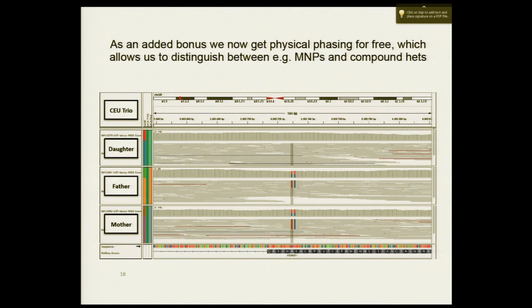What I've read online about HaplotypeCaller is that some people have issues with the genome that they use. Like if they use their own particular genome, it doesn't work, but if they use the one suggested by GATK, then it does work. Are you aware of that at all? No, I'm not quite sure what you mean. You mean like a different reference build or something? Yes. I don't know what the differences are. Yeah, I'm just not sure.